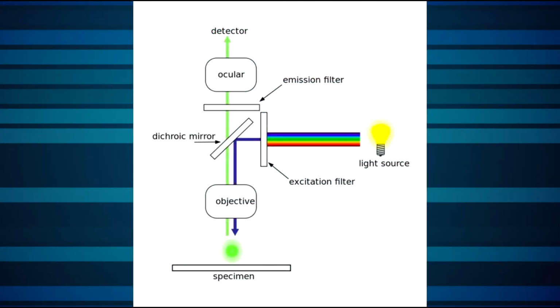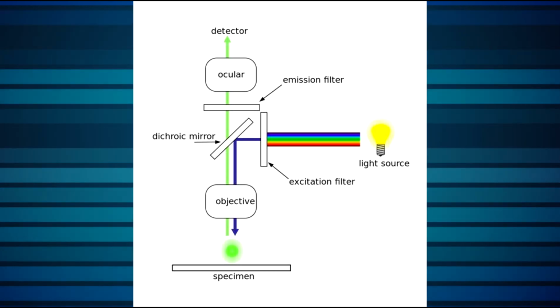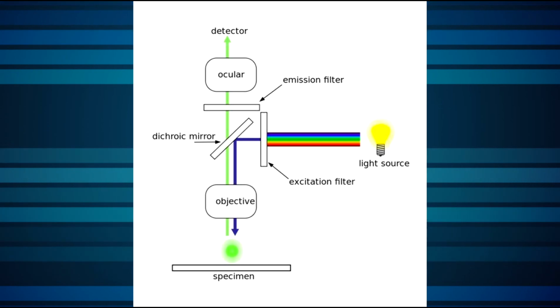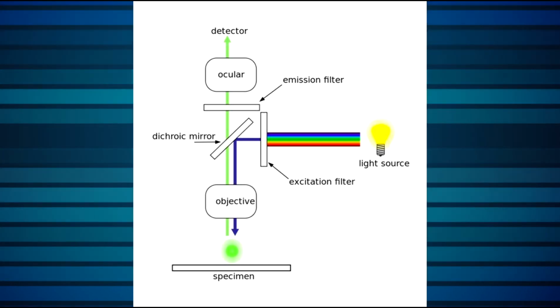However, power output of light sources changes over time. Also, the total energy delivered to a specimen will depend on the optical beam path of the microscope, as well as filter sets and objectives used. This makes comparisons between experiments performed on different microscopes complicated.